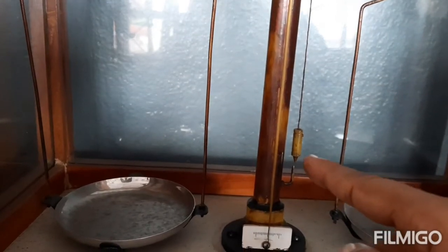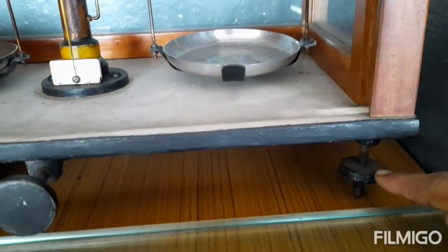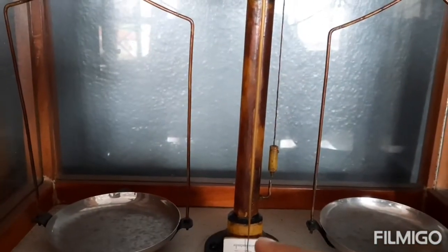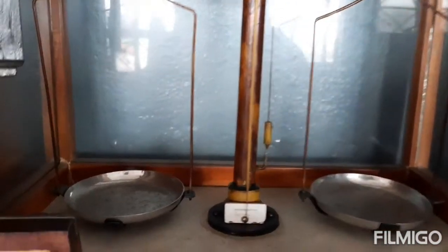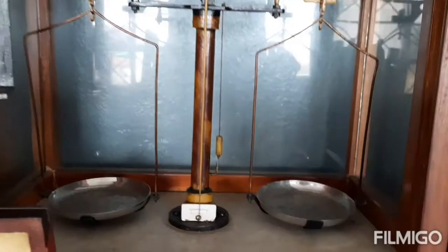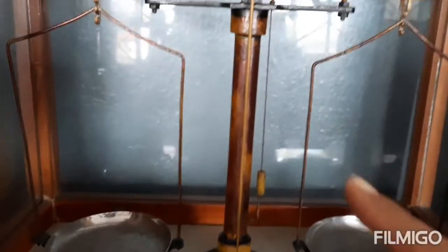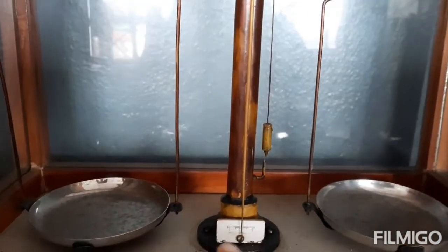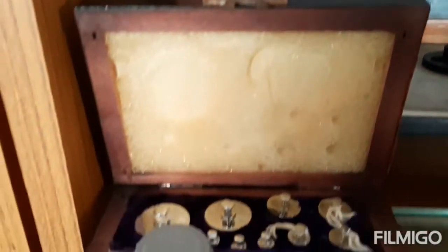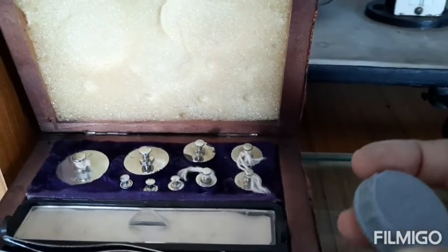This particular thing which is hanging is the plumb line. We can adjust the screws out here and make the plumb line straight so that the balance shows the middle point. We can adjust the screws and balance it — make the plumb line straight so that the pointer shows the midpoint.